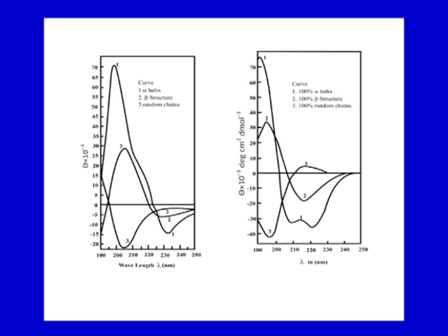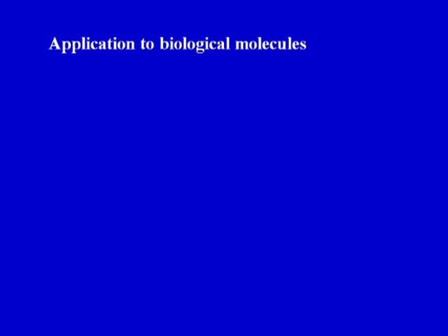Likewise, the peaks are much more clear and distinct in CD spectra as compared to ORD spectra. So, CD spectra is most of the time utilized for different applications, particularly structural or conformational determination of macromolecules and other molecules also.